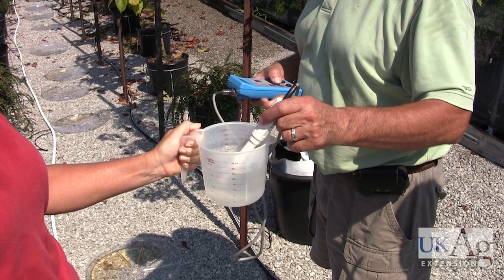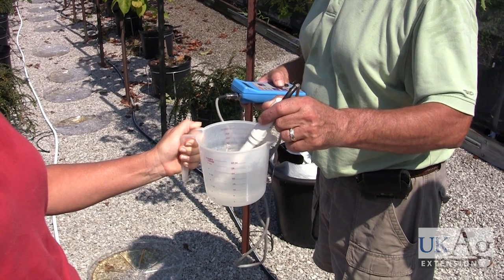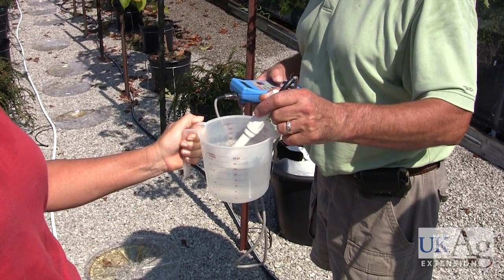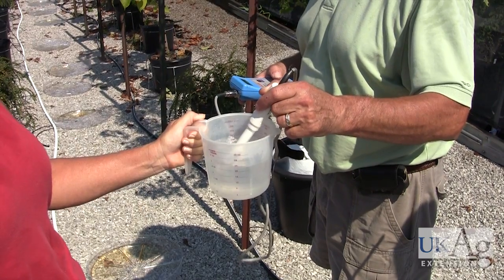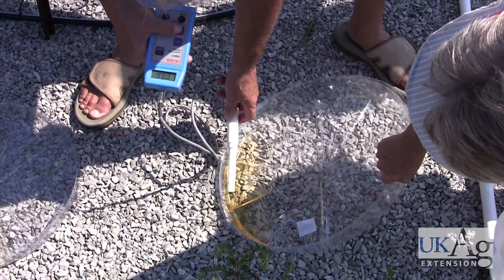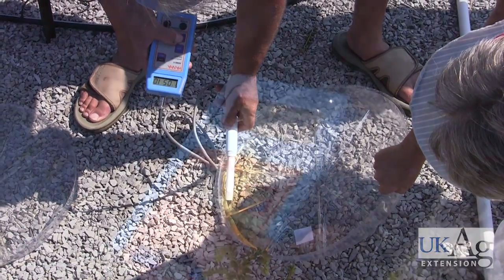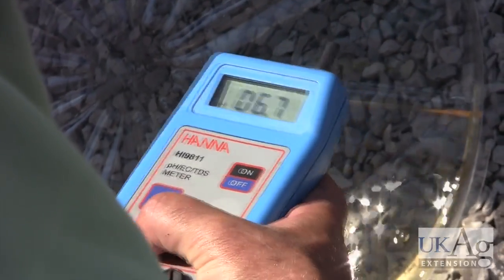Begin your measurements by reading the pH and EC of your irrigation water. The EC of your irrigation water will be subtracted from your readings to give you an accurate number. Tilt your collection tray to pool your leachate, allowing the probe to be completely submerged. This is important for accurate readings.